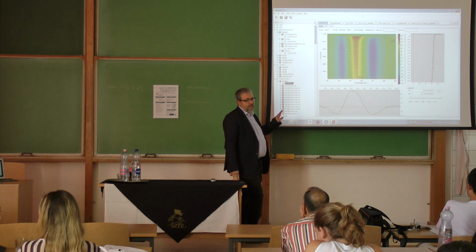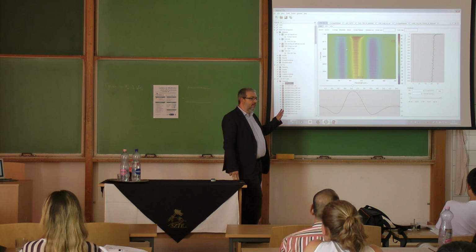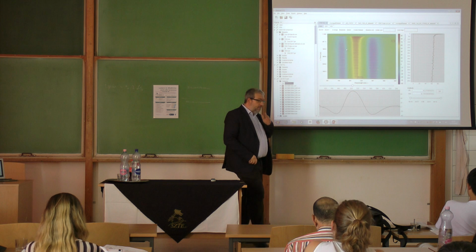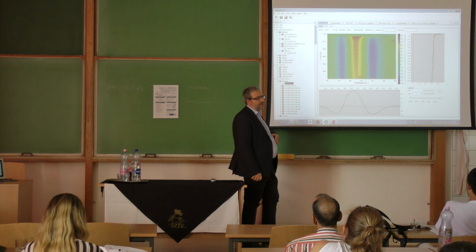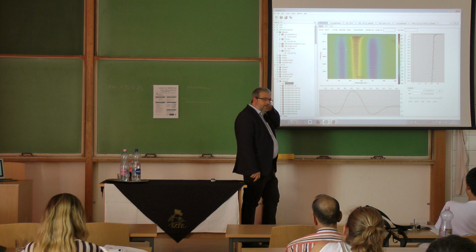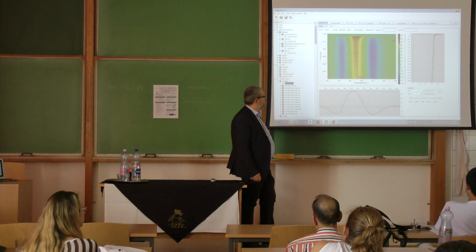In infrared we did 2D. In that case we are indeed using the frequency domain. In that case we have this pattern on the diagonal, and you can look at which vibrational modes are connected. In this case it's not needed. A very long time ago we did a Fourier transform on this one, but basically this is enough for our purposes.